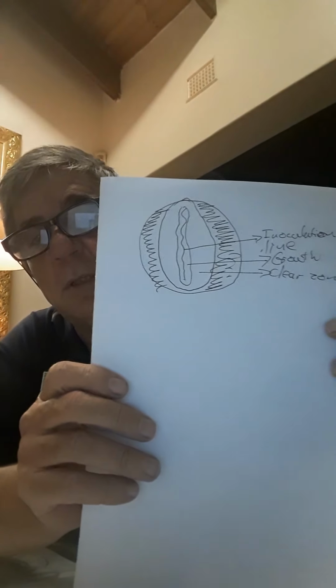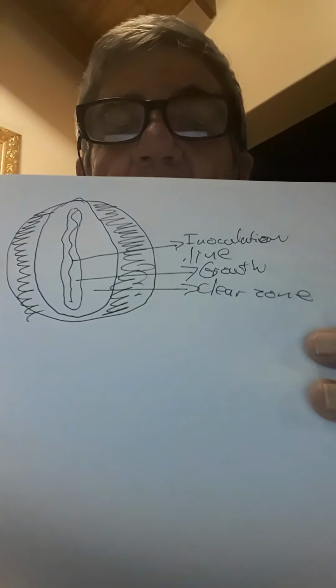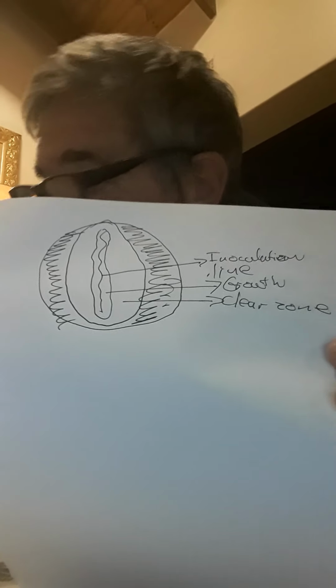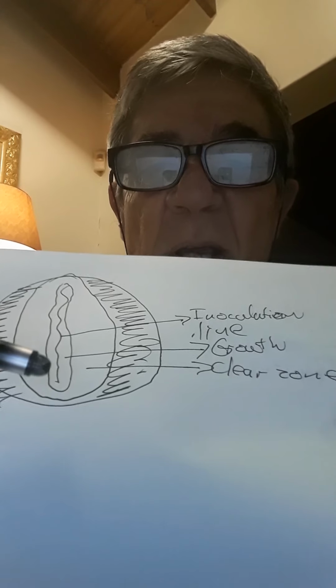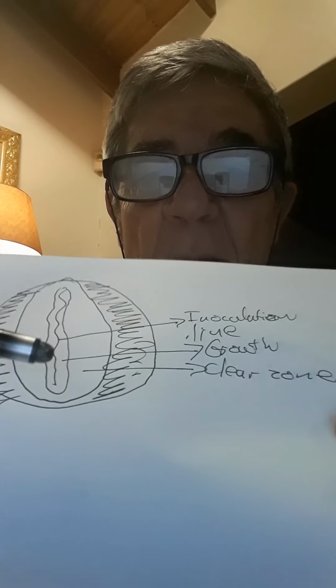Alright, on page 102, they talk about evidence of starch hydrolysis. What are we doing? If we've got the nutrient agar plate, the first thing that you will see is the line that we streak in the middle. Let me just get my pen here. That is a streaking line, and then after incubation, we will see there's growth on the nutrient agar plate.